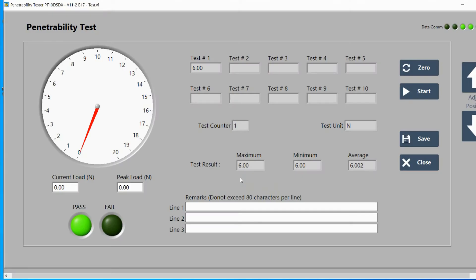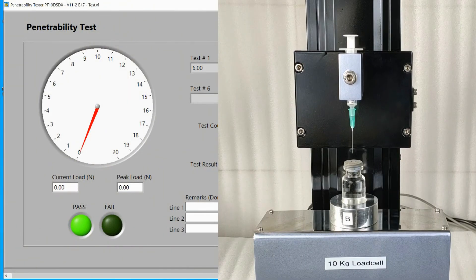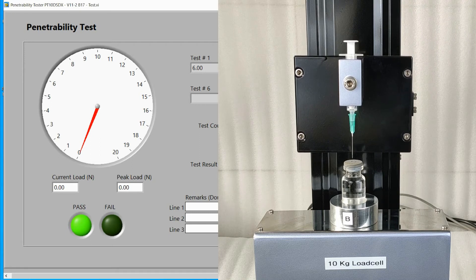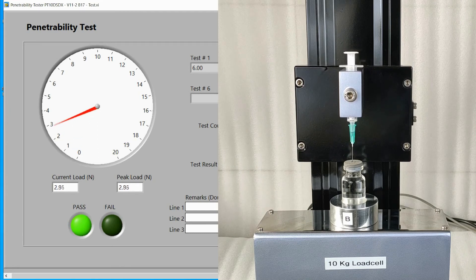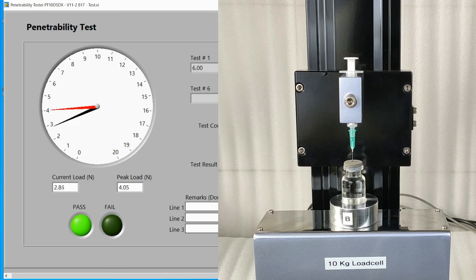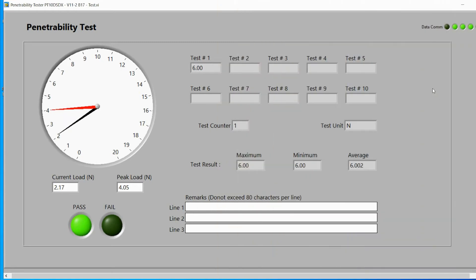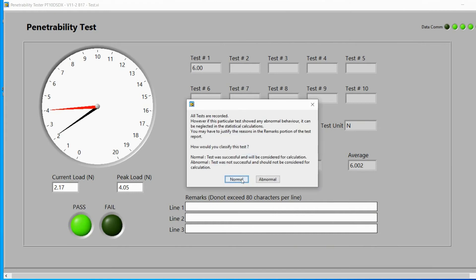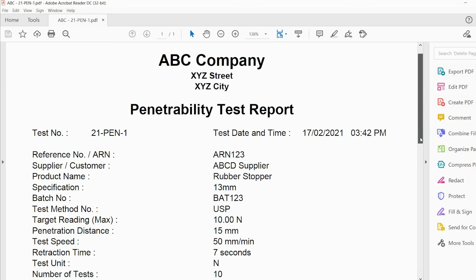Press 0, then press start. Once again, click on OK, then select abnormal or normal. Repeat the test until you have at least 5 readings, or a maximum of 10 readings. Now, click on save. A PDF test report will be generated.